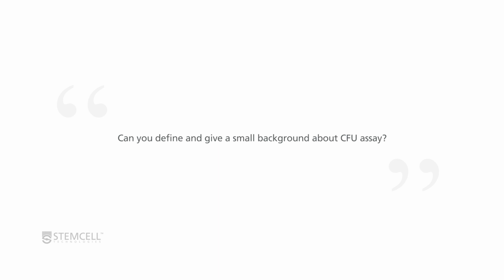The reality of the CFU assay, as a biological assay, is the concept of really being able to identify those cells that have proliferative potential ex vivo. When you have mature blood cells, proliferation really slows down as those cells mature. So we know that, with the exception of mast cells, mature cells don't really proliferate. So it's the ability to put those cells in as a progenitor. You would plate, for bone marrow for example, 10 to the 4 cells. That's a lot of cells, but typically only around 50 to 100 of those at that concentration are actual progenitors that will grow. If you put that in a semi-solid media where they grow in a spatially identifiable way, you can really see those as independent clones, as colonies.